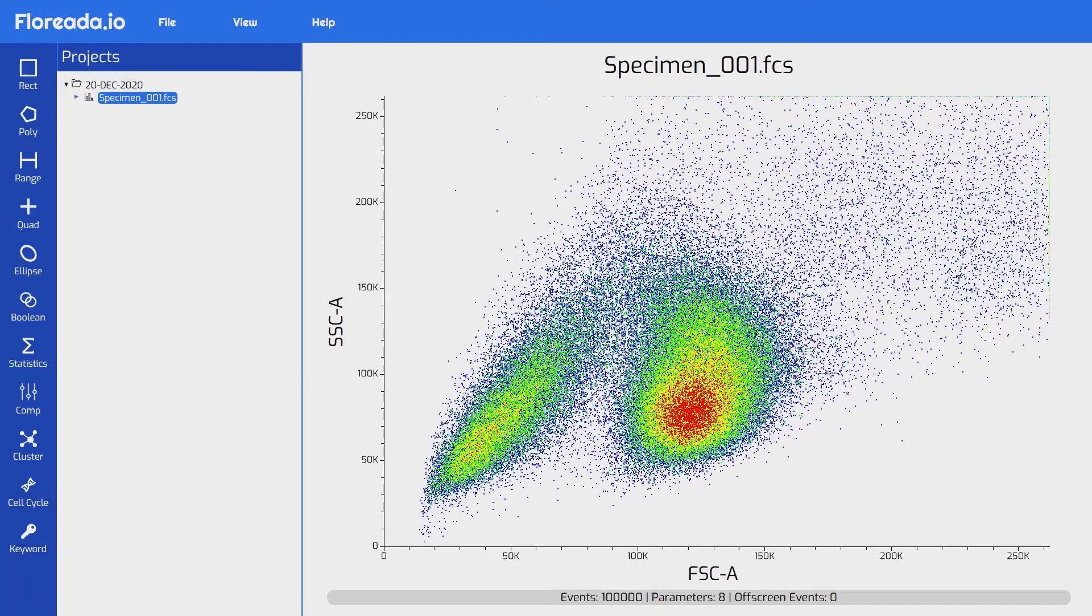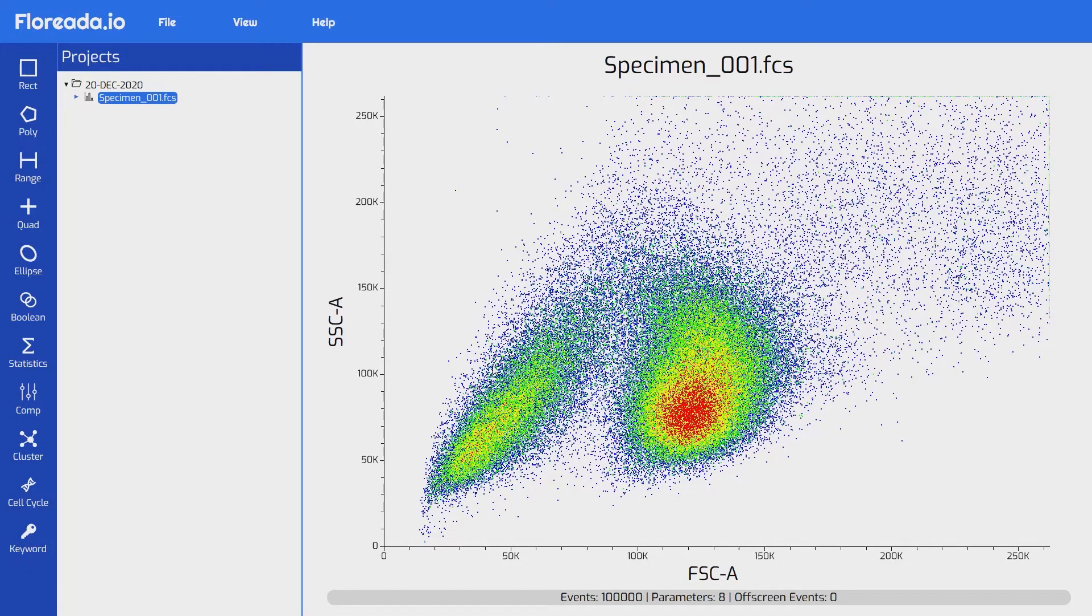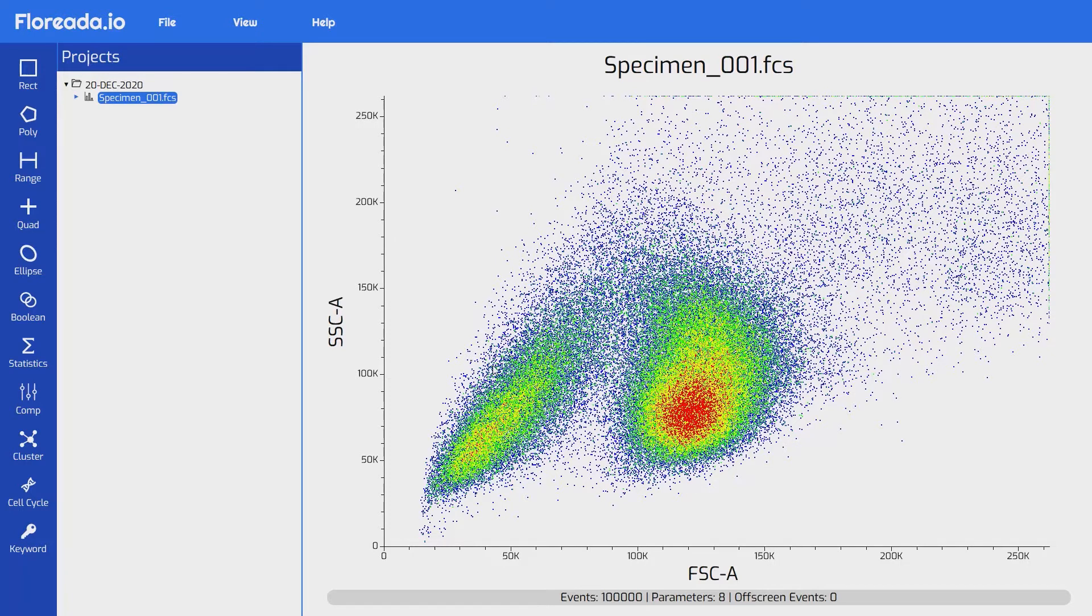You'll see a couple of things happen. First, on the far left-hand panel, we see a number of options that we're able to select, including different gates, statistics, compensation, and clustering options. Next to that, we have a list of our currently opened FCS files grouped by their project name, with the currently active file being highlighted in blue. Right now, we just have the one file open. If the FCS file we just opened had a spillover matrix included in it to use for compensation, that would also be displayed. We will talk more about compensation in a later video.